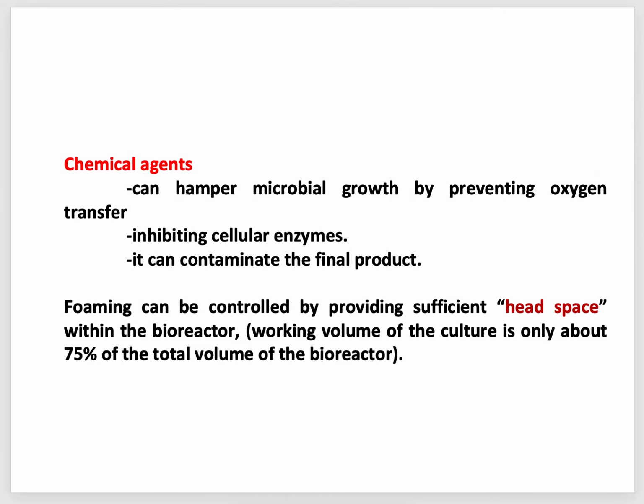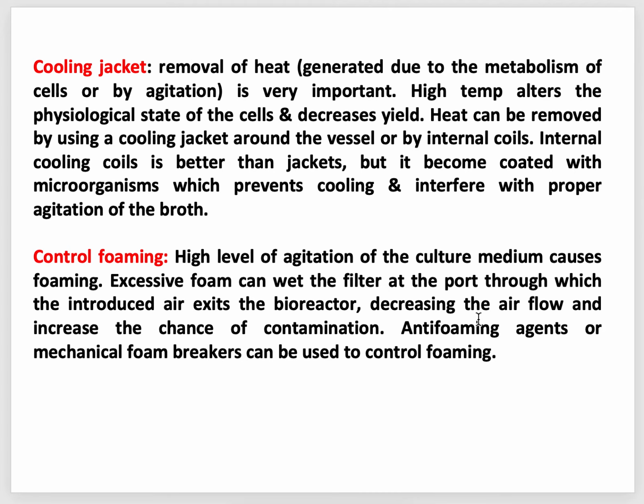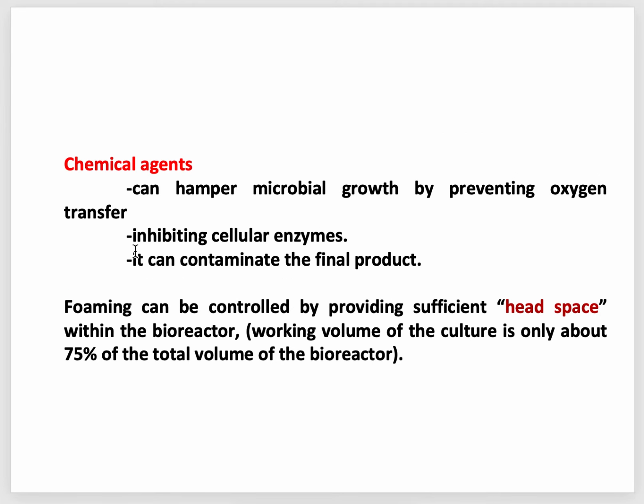However, the anti-foaming agents are chemicals. So these chemicals can cause some troubles in the fermentation process. The chemical antifoams can hamper microbial growth by preventing oxygen transfer and inhibiting cellular enzymes. They can also contaminate the final product.